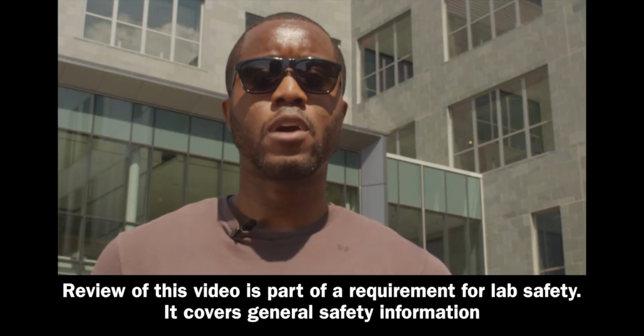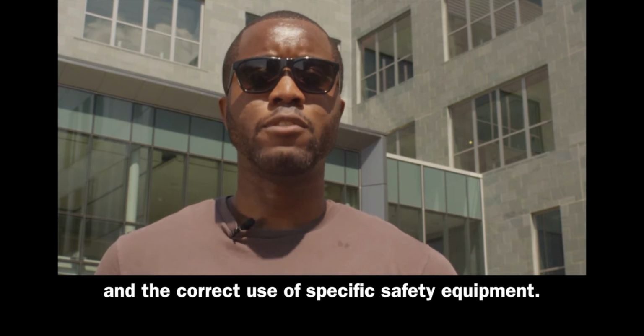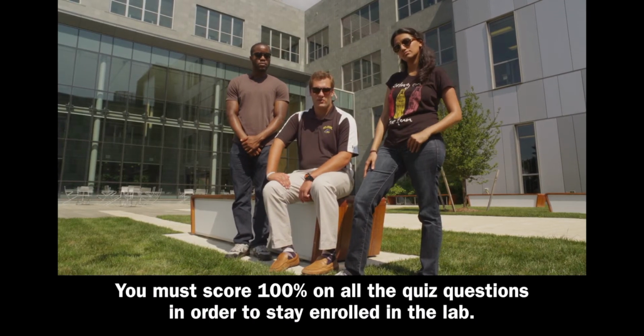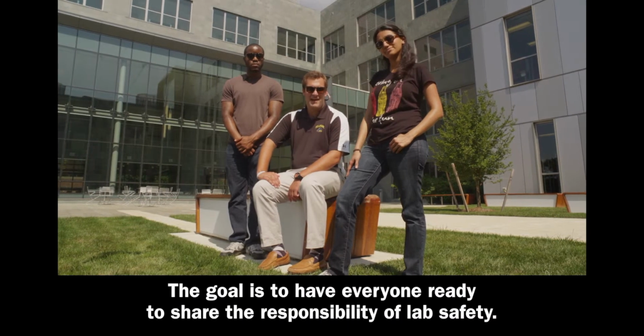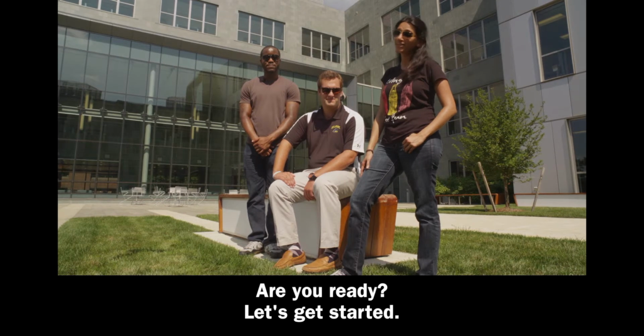Review of this video is part of a requirement for lab safety. It covers general safety information and the correct use of specific safety equipment. You must score 100% on all the quiz questions in order to stay enrolled in the lab. But don't worry, you can always go back and retake the quiz. The goal is to have everyone ready to share the responsibility of lab safety. Are you ready? Let's get started.